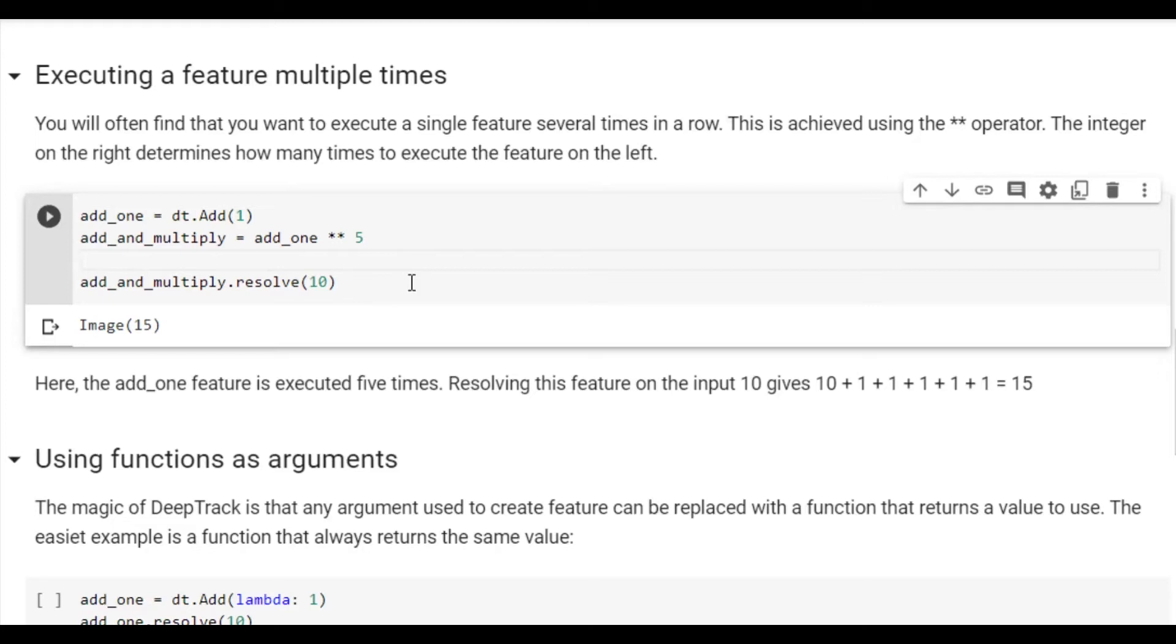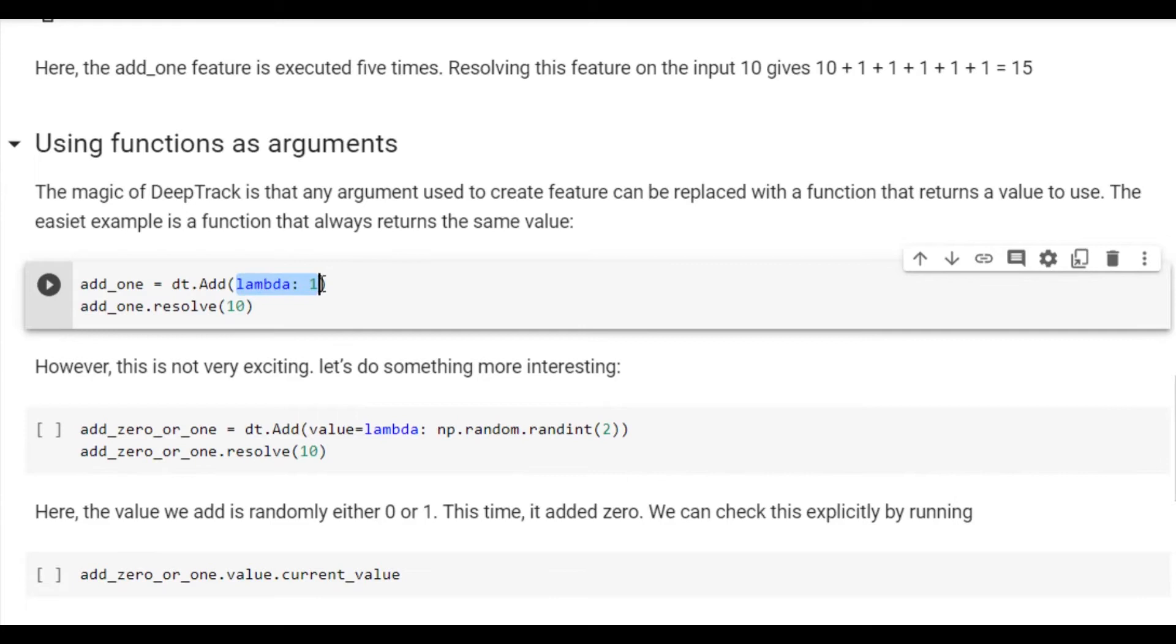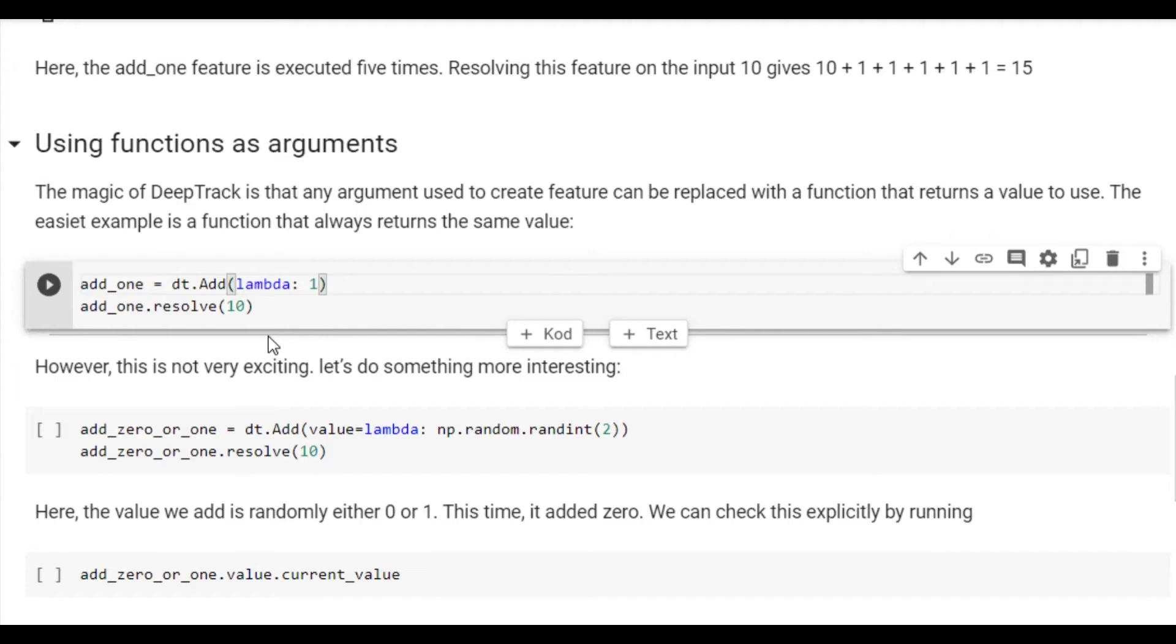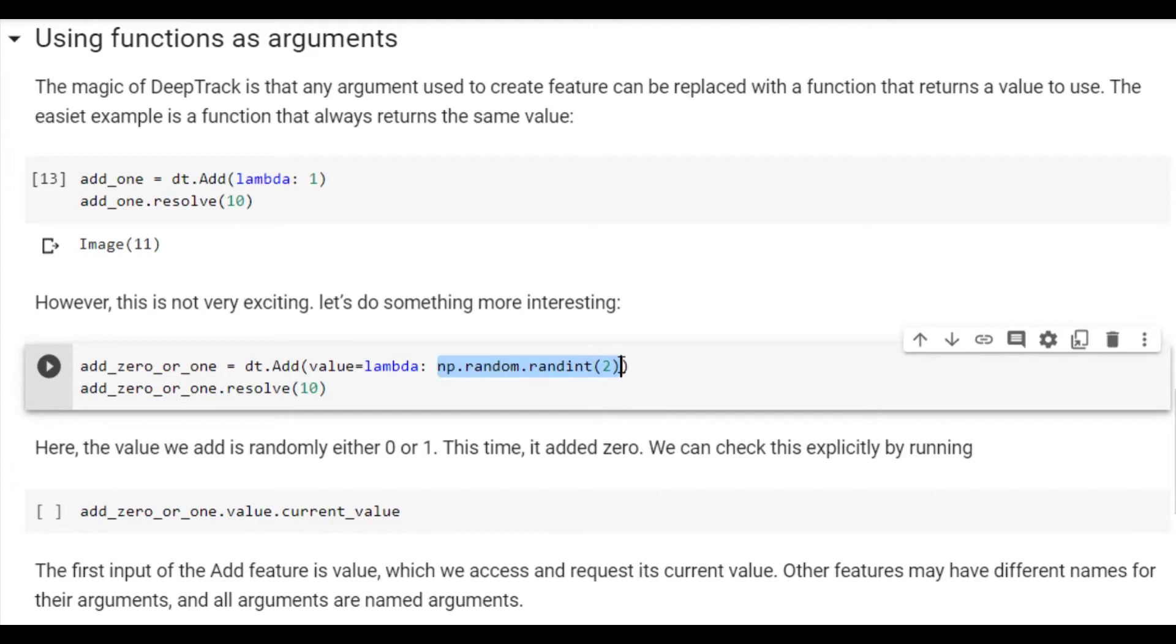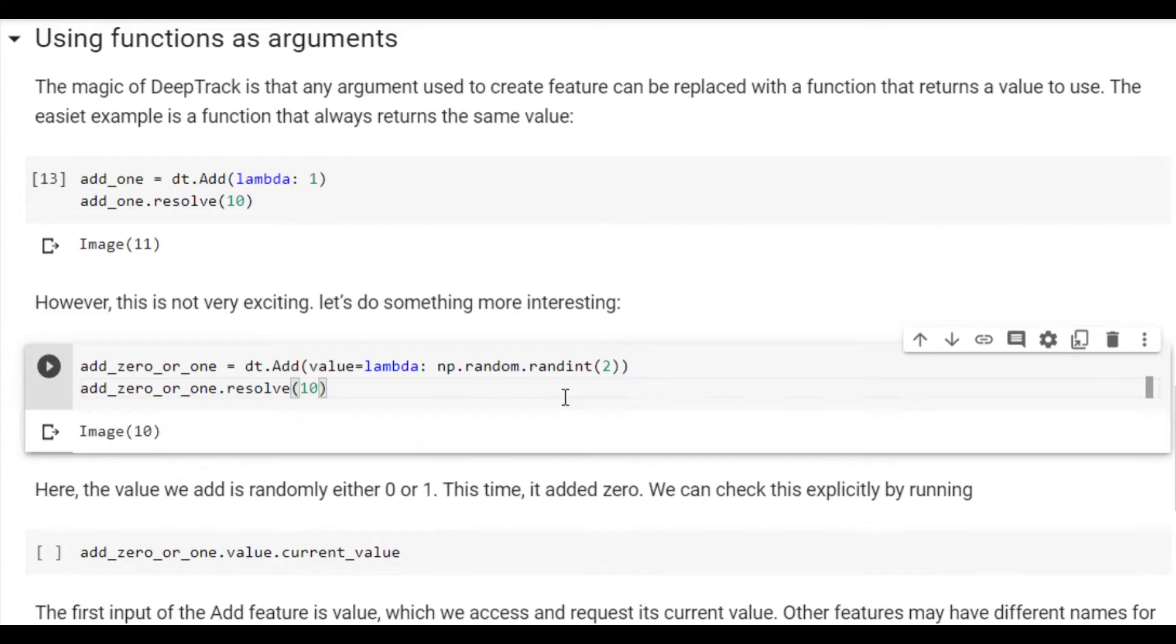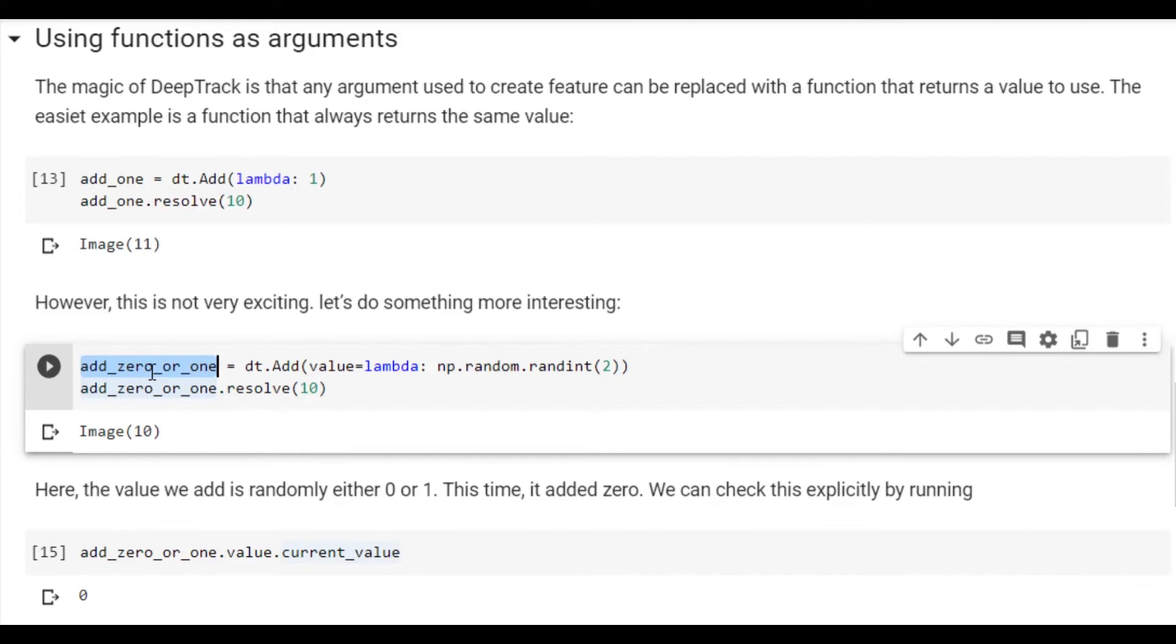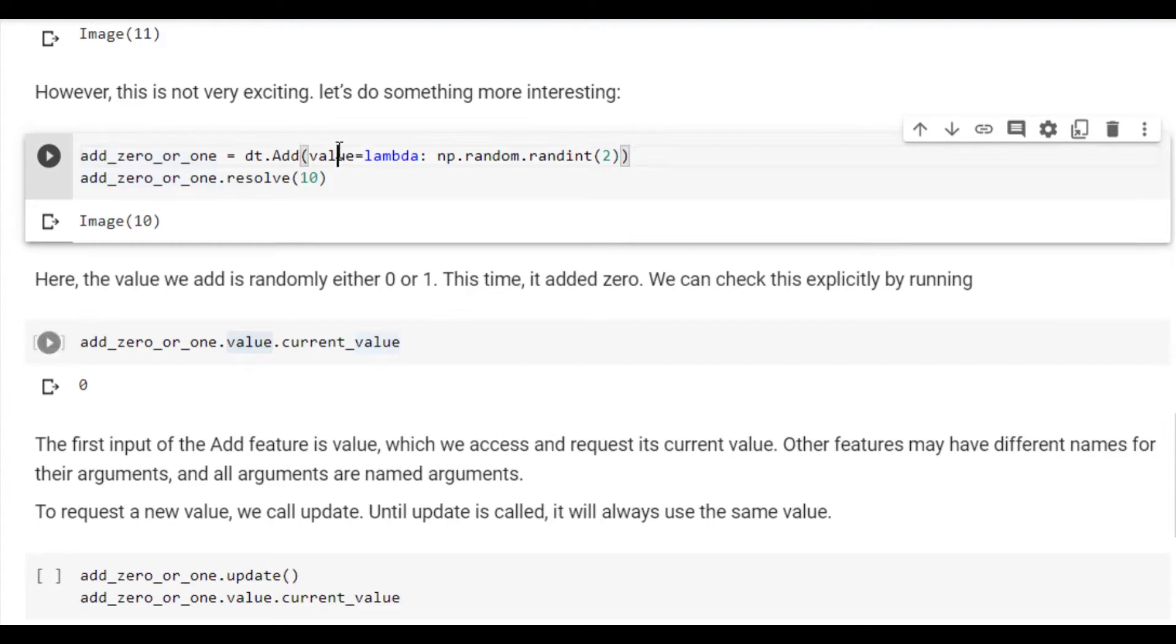What is truly special about features is that any argument can be changed from a value to a function that returns a value. The simplest case here is simply a function that directly returns the same value. So passing a function that returns the value of 1 is in fact completely equivalent to simply just passing the value of 1. Where this becomes interesting is in the fact that you can have a non-deterministic output. For example, here we have defined an add feature which randomly adds either 0 or 1. So if we resolve this feature, we see that this time it added 0, because 10 plus 0 is 10. We can check that it was in fact 0 it added more explicitly by calling add 0 or 1 dot value, which is the name of the property, dot current value, which is 0.